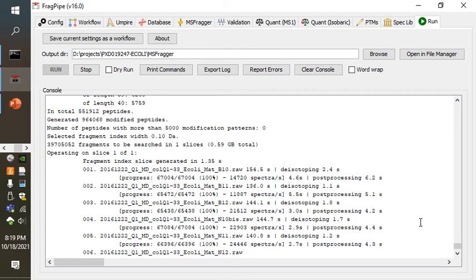Just for reference, the original Sequest algorithm was largely developed on a Pentium Pro 200, which is to say 200 megahertz. Given that this 10-year-old server is 2.8 gigahertz rather than 200 megahertz, it's astonishing how quickly we've seen sort of a parallel race taking place.